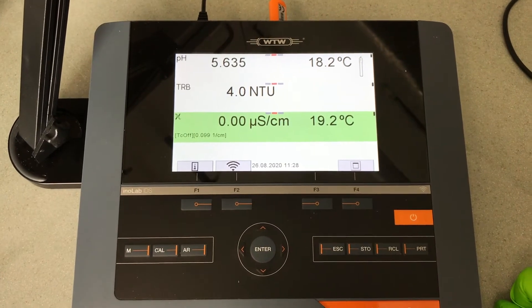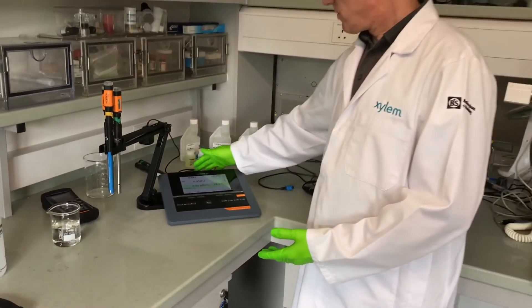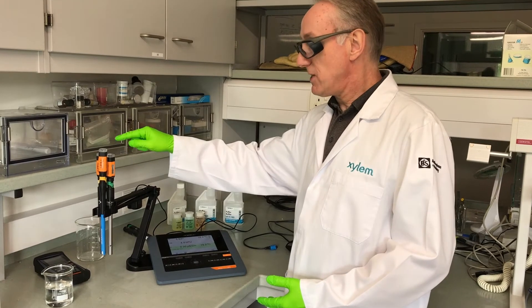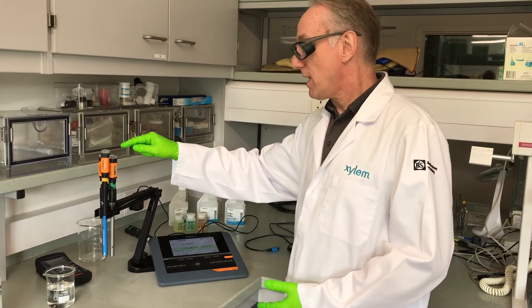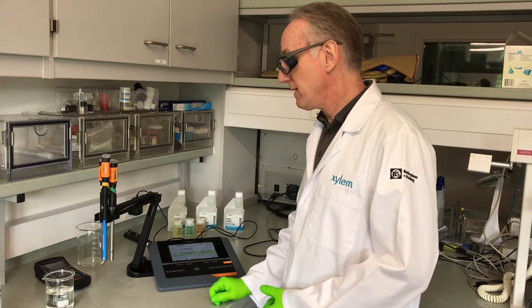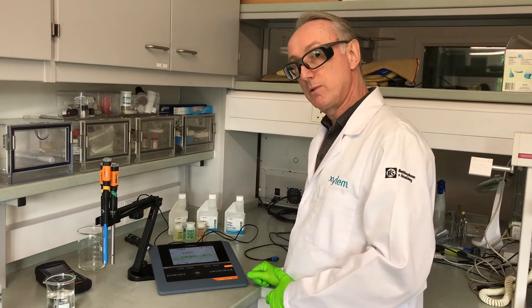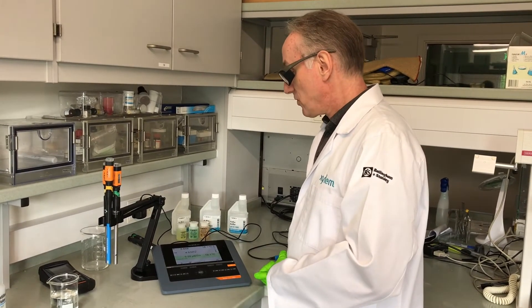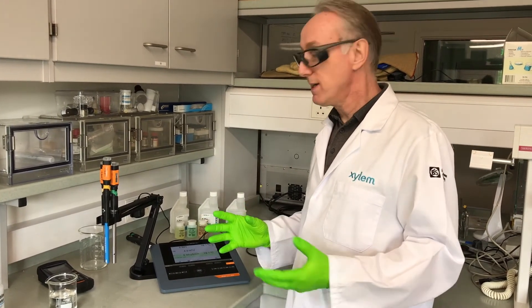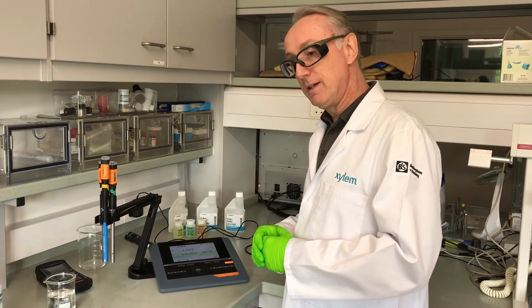As we pan out, we can show that there are no wires — we have the single connector on the back of the meter, and each of these probes is now connected wirelessly. You can see them flashing and displaying continually, and that gives us a great advantage because we're not restricted to having to work around the meter. Three people could effectively be using each of those probes in different parts of the laboratory, as long as those probes remain within 10 meters of the bench meter sending signal.